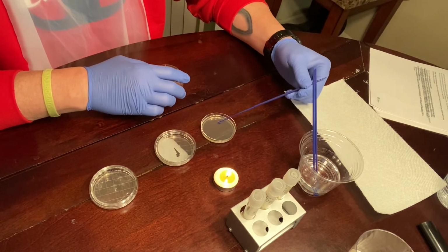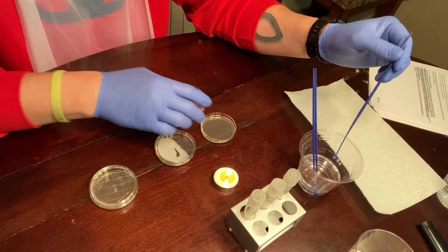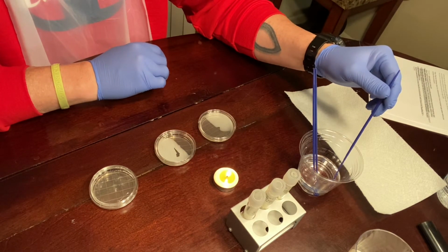I'm going to take it from the third quadrant to the fourth quadrant in a zigzag motion. And what I'm doing is just creating different colonies of the same bacteria.